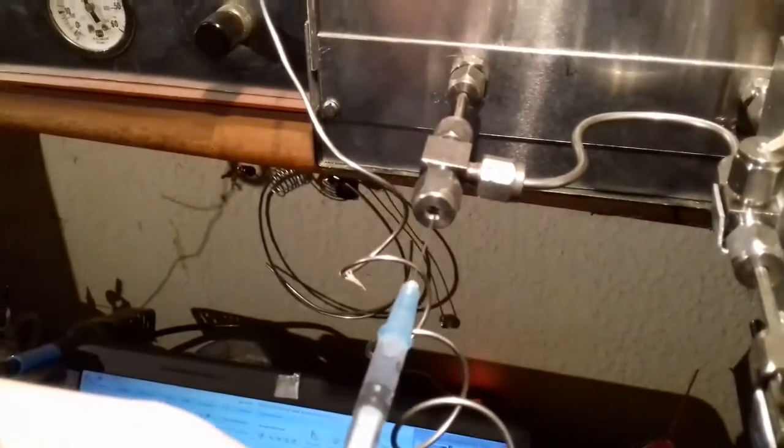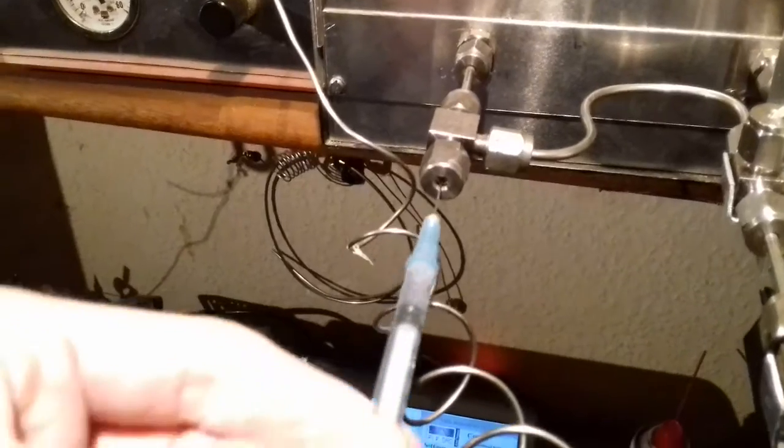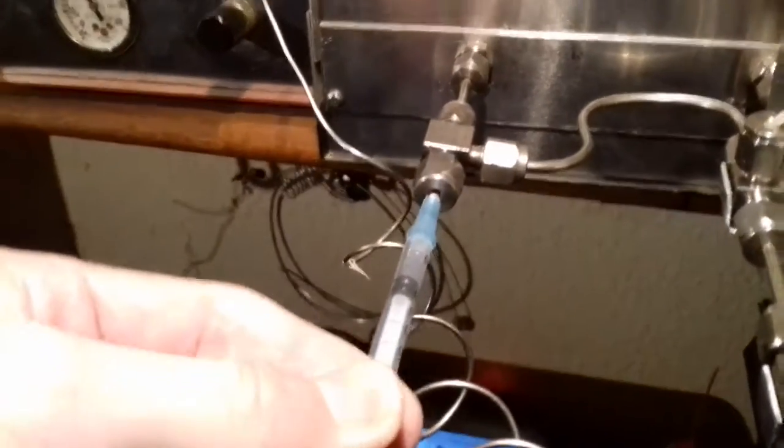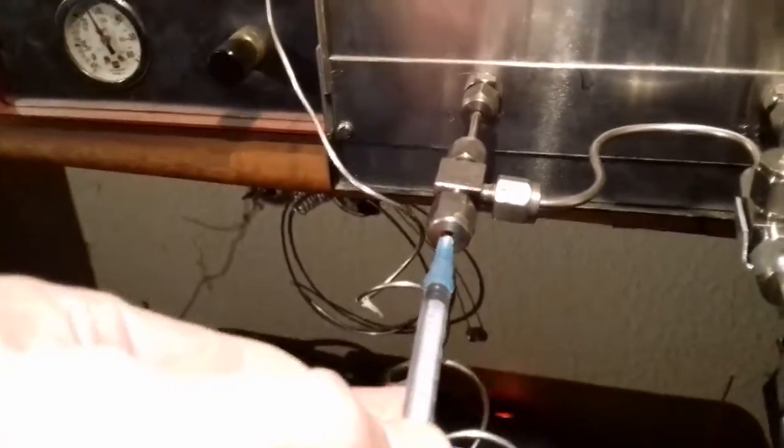So this is my latest project: a home-built gas chromatograph.